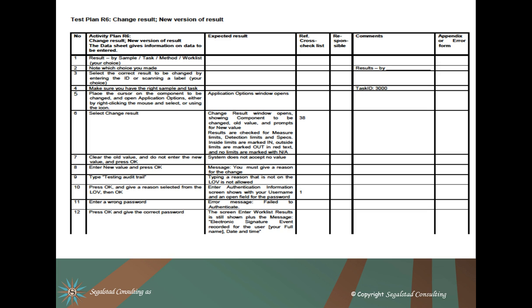And it has links to the user requirement specification or functional specification. This is often called a traceability matrix. One may also want, or instead want to create a separate document as the traceability matrix between the user requirement specification, the functional specification, and the testing itself. This will give a better overview, and if you're using Excel, it can be sorted in various ways.